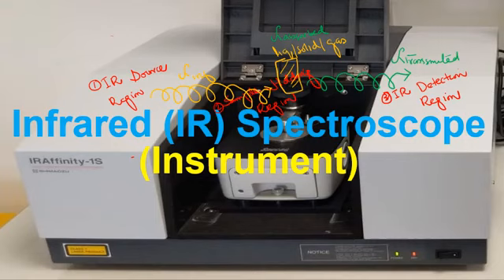On the basis of the absorption of a specific wavelength of infrared radiation, and on the basis of the transmission of the infrared radiation, we generate the infrared spectrum, and on the basis of that, the functional group as well as the bonding in a chemical compound or in a molecule is determined by the infrared spectroscope.